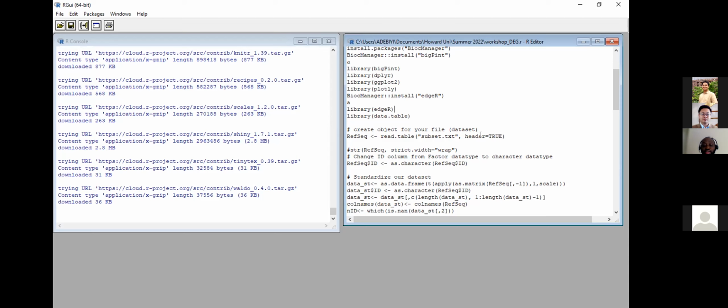And then you say header equals TRUE, TRUE in uppercase. If it's in lowercase, you'll get an error. So R in this case, pay attention to that as well. So this will read my subset text into the refseq, and then we can start using the refseq for our downstream analysis. Just want to carry everyone along as much as possible. So let's see.